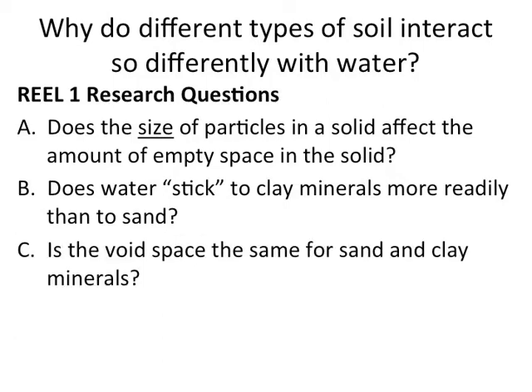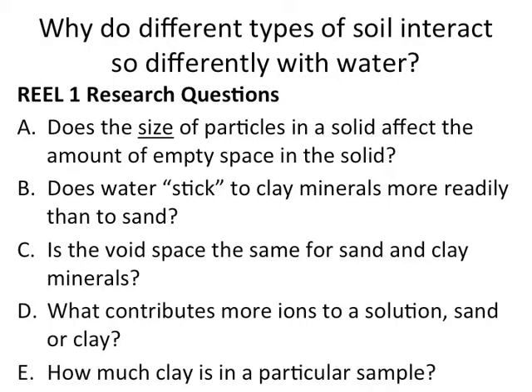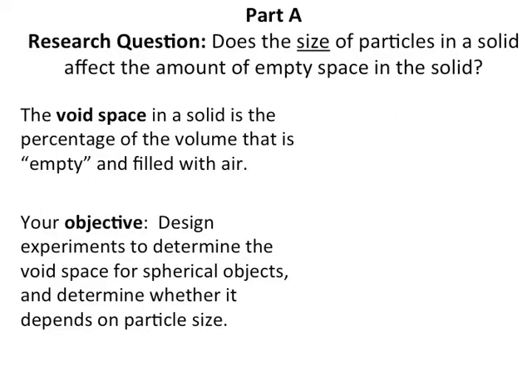In Part C, you will consider whether the void space or the empty space is the same for sand and clay minerals. In Part D, you will continue your characterization of sand and clay minerals by considering which one provides more ions to an aqueous solution. And finally, in Part E, you will work to characterize how much clay is in a particular sample. Let's look more closely at each of these research questions.